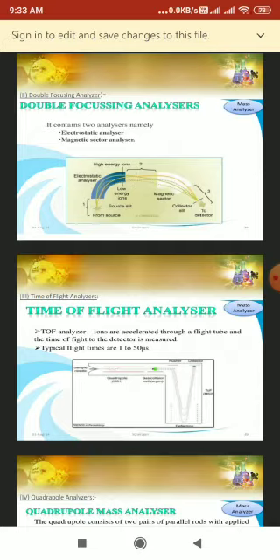In Bendix's time of flight mass spectrometer, a pulse of ions is produced in the ion source. An accelerating potential of the order of 2000 volts is applied to a grid in the form of a voltage pulse lasting a microsecond or less, and is repeated intermittently.